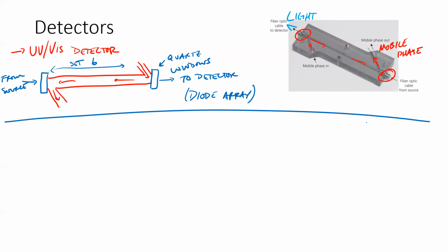There are a couple other types of detectors. I already talked a little bit about the laser diffraction, right? And so that's where you have your sample. So here's our mobile phase coming out. It goes through a small opening. And so we narrow it down, just like putting your thumb over the garden hose, right? It causes you to increase that pressure. And so you get this sort of jet stream of mobile phase.